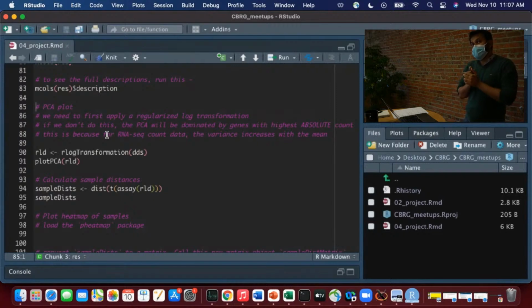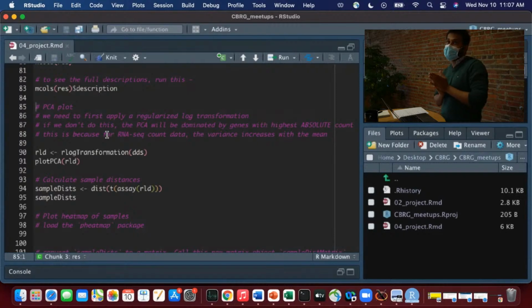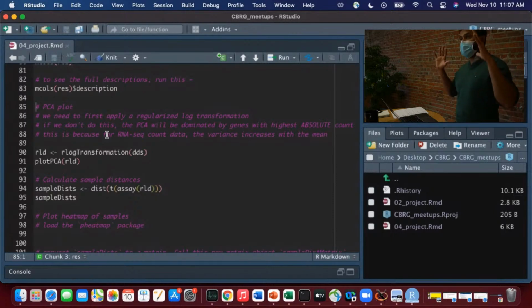So today, we'll mostly just be doing data visualization. One thing that is often done with omics data is to do principal component analysis. Briefly, I assume people watching this are familiar with PCA. PCA can be used for many things, but from a data visualization perspective, it projects this high dimensional data, which is impossible to picture, onto lower dimensions, so 2 or 3 dimensions, so you can actually see your data points.